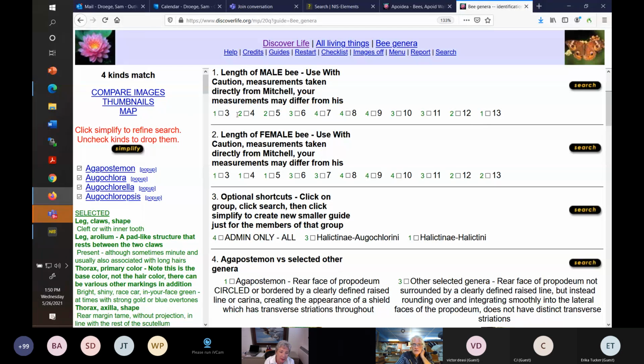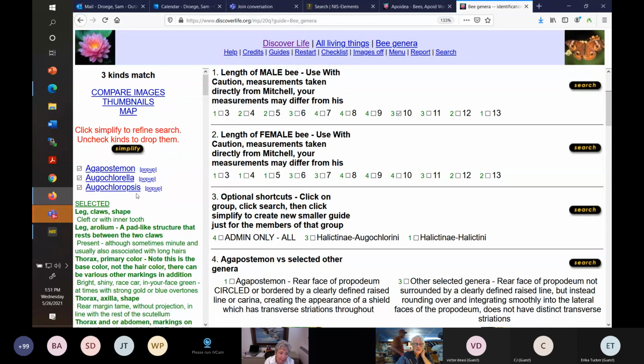And you can see from the green scorings now that in the middle, all 4 are in this. If you click on a 7 to 8 to 9 millimeter one, all 4 are that way. But if it's like, oh, you know what, that's clearly, like we saw, that's clearly a 10 millimeter long one, then theoretically, and it did, thank goodness, one of them drops out. And when you do this, you don't have to have all of them drop out. It's useful to do something that drops out something.